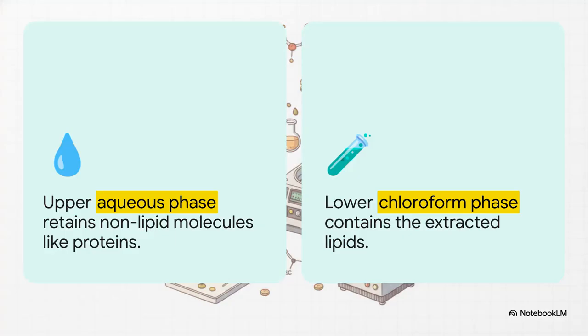Another fantastic technique is the Bligh and Dyer method. We use this heavily for samples with high water content.